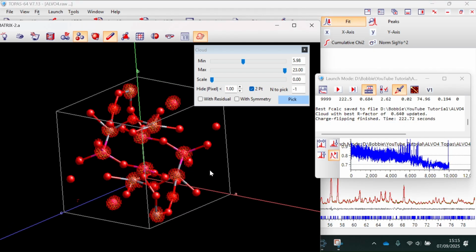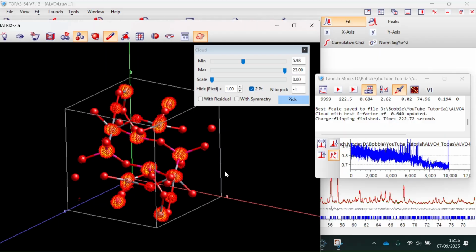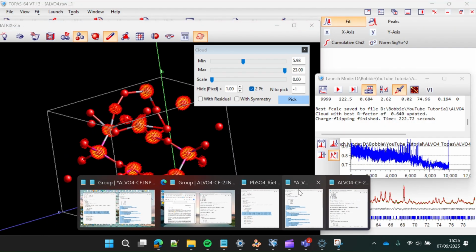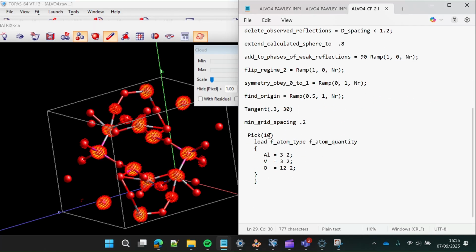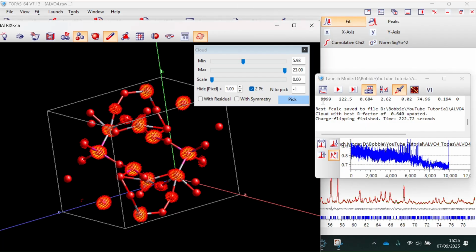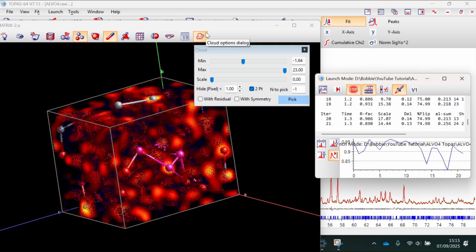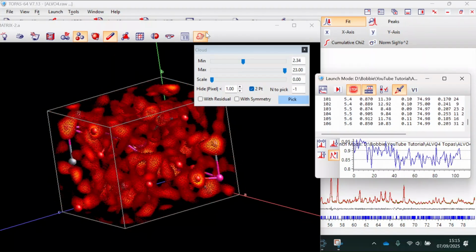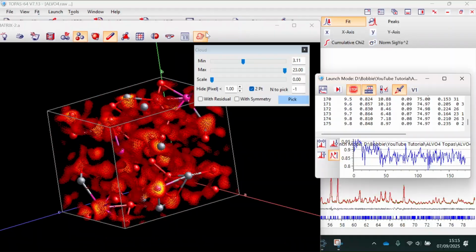So the result wasn't great again. So I'm gonna run it now, but I'll run it on pick one. See if that works. And I'll be back once it's done.